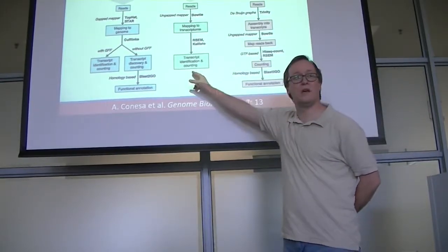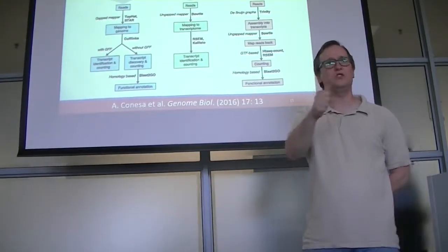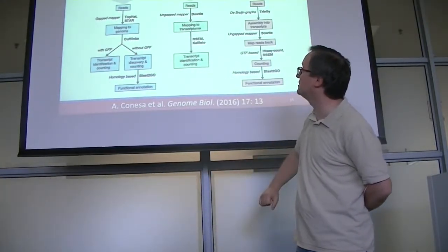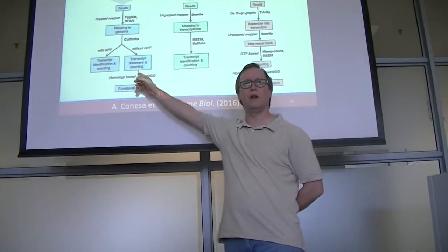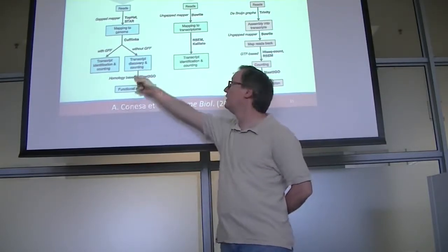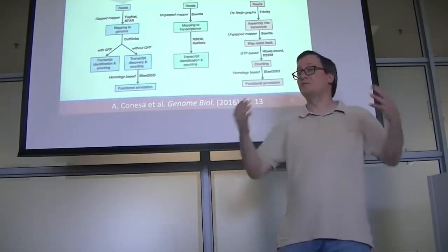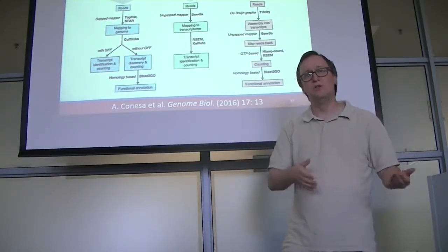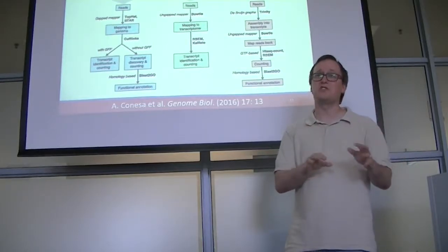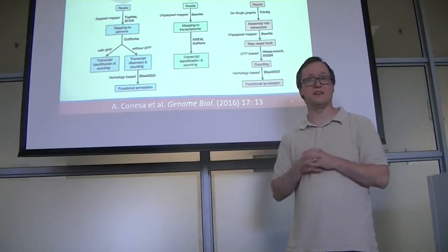In this case, we would be doing the microarray experiment, essentially, trying to figure out which genes are producing the most transcripts. That's kind of this middle path that we see. And sometimes you're trying to figure out whether you can trust the annotation that's been produced in the past for an organism. For that, this pathway over at the left is available. So there are lots of tools out there. Which one you use is going to depend on the purpose to which you're putting your data set. And just because someone produced a data set for one purpose does not mean that it can't be reapplied in one of these other contexts.